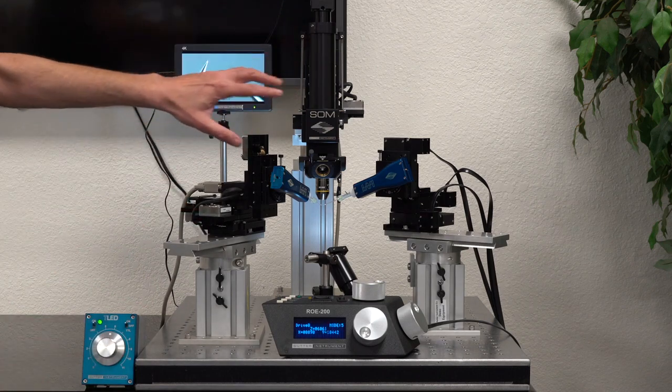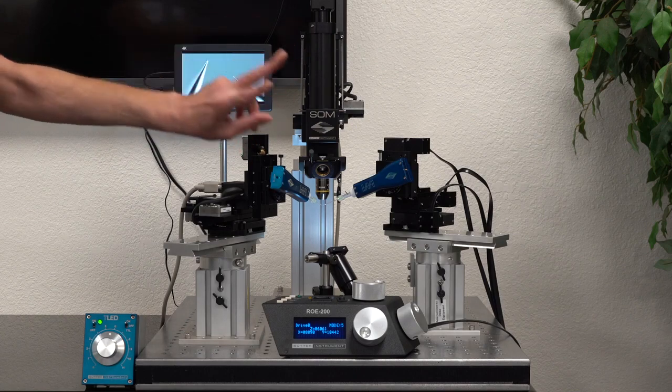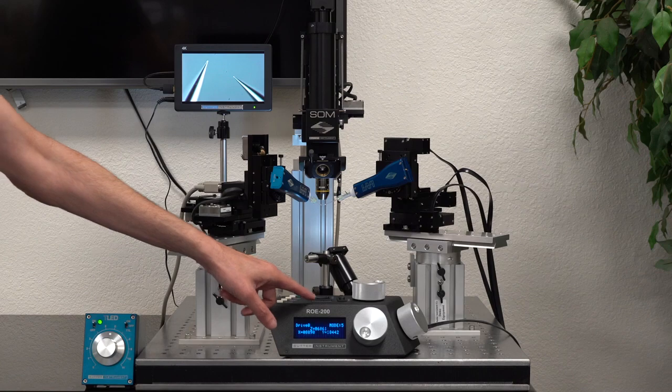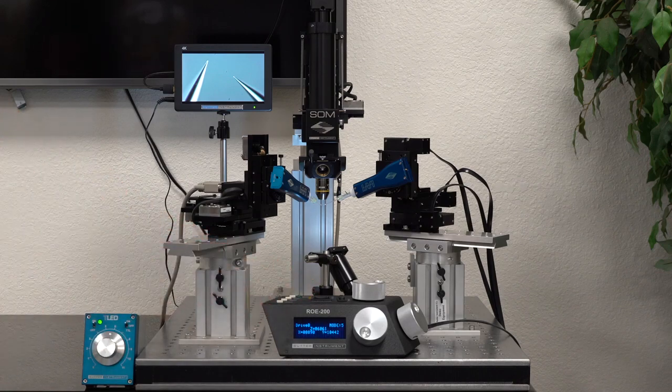All of these three manipulators are attached to two MPC 200s and all three devices are operating off of this one ROE 200.